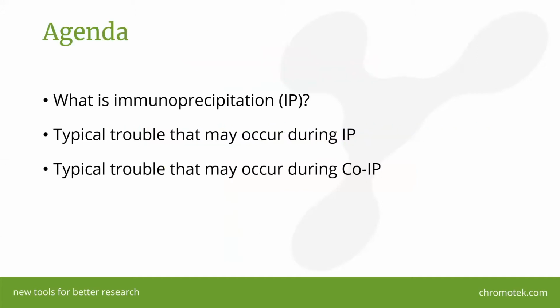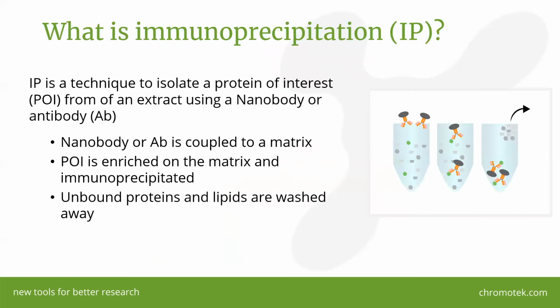So first of all, I would like to shortly again explain what immunoprecipitation is, and then we focus in the first part of our troubleshooting on immunoprecipitation, and we add a second part which is focusing on the troubleshooting of co-immunoprecipitation.